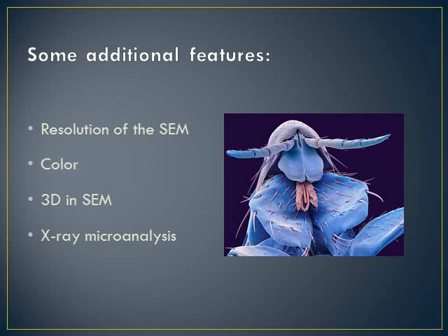Color. The most common configuration for an SEM produces a single value per pixel, with the results usually rendered as black and white images. However, often these images are then colorized through the use of feature detection software or simply by hand editing using a graphics editor. This is usually for aesthetic effects or for clarifying structure and generally does not add information about the specimen.